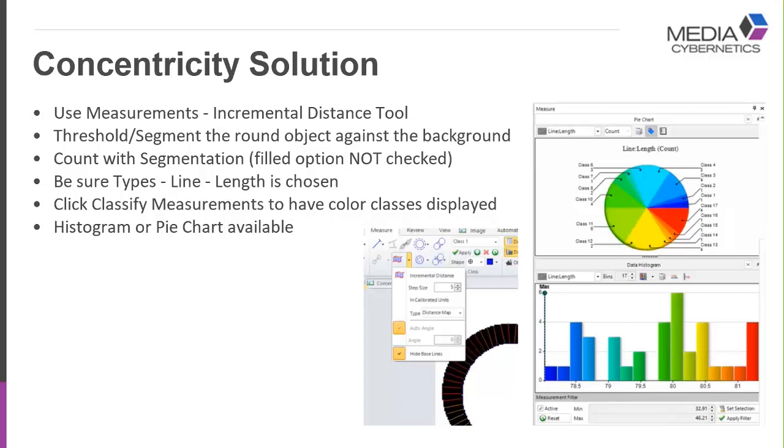We essentially end up with two outline traces, one around the OD and one around the ID. We want to make sure that in our measurement types we have line length chosen. Once we're displaying our data, if we'd like to have a color superimposed for the various classifications or classes created by the number of bins, you can click on the color icon.